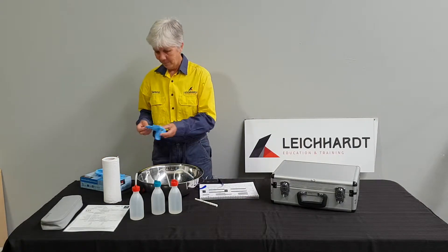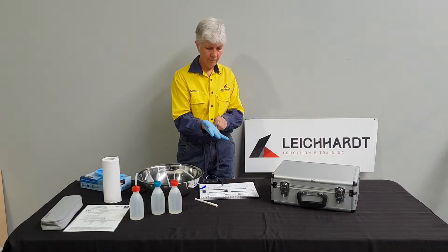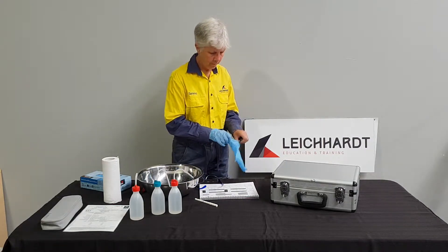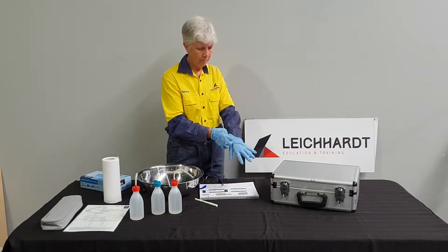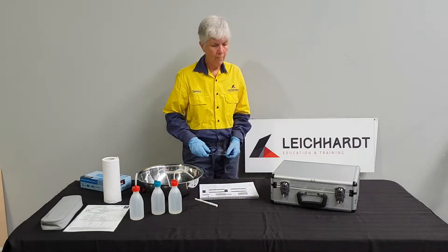Welcome to the first in a series of videos demonstrating the operation of the WP81 Water Quality Meter. This meter is used to take in situ measurements of environmental parameters such as pH, conductivity and temperature. In this video, Serena will show you what is in the kit that we are providing for training.